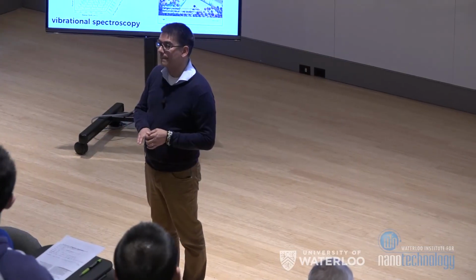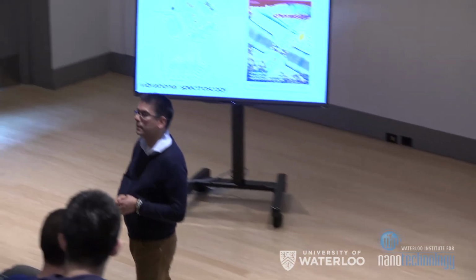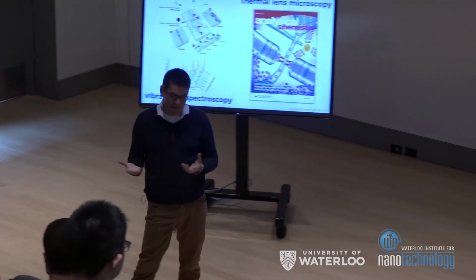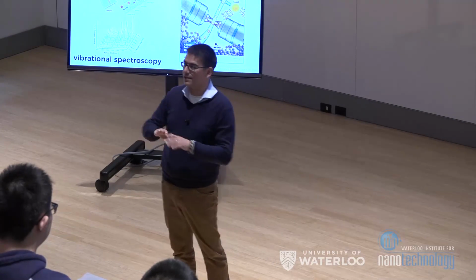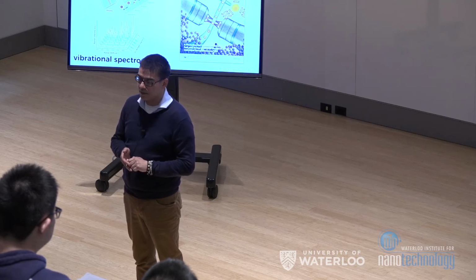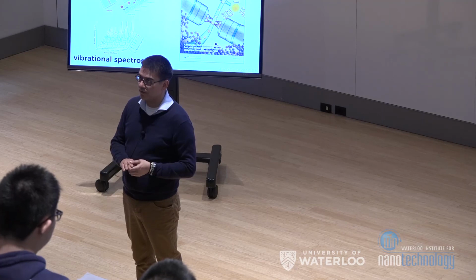Very nice, thank you. There's an irony in that you're using SERS after having spent so much time avoiding surfaces. Yes, absolutely. Surfaces are really interesting. I think the bottom line is we try and ignore surfaces as much as possible. And from experience, the surface in microfluidics really controls everything that you do.